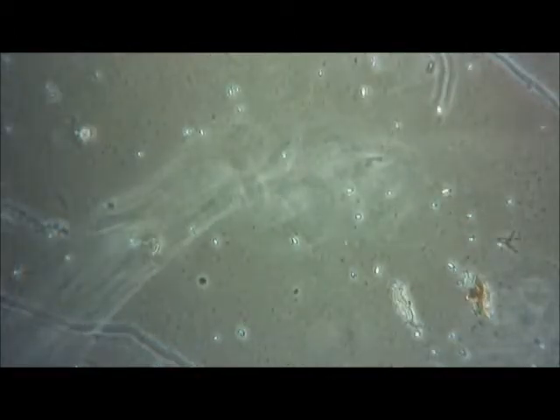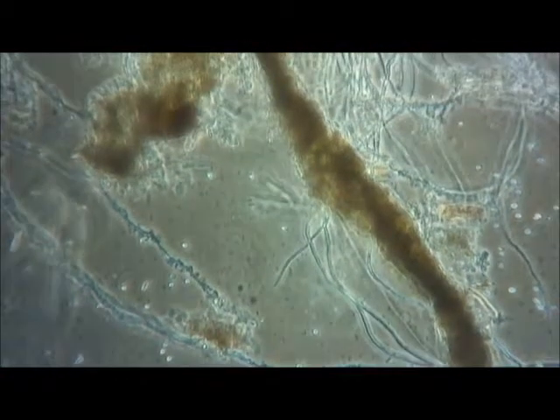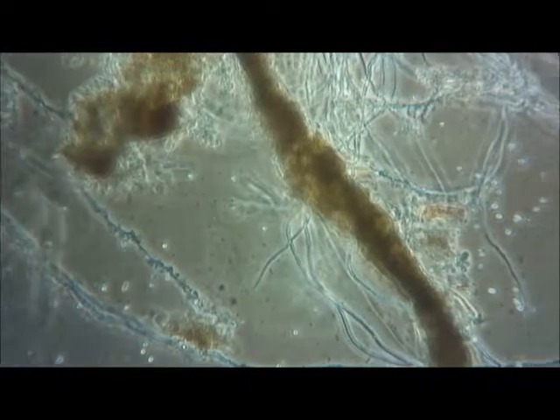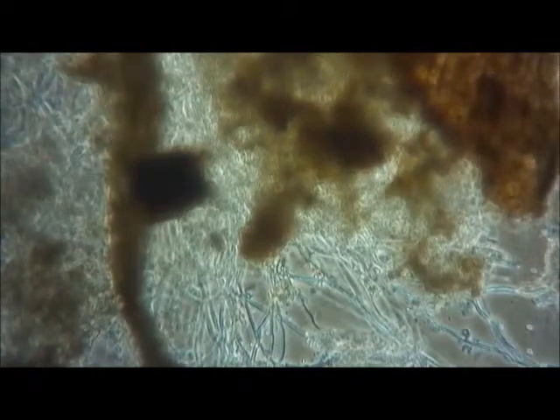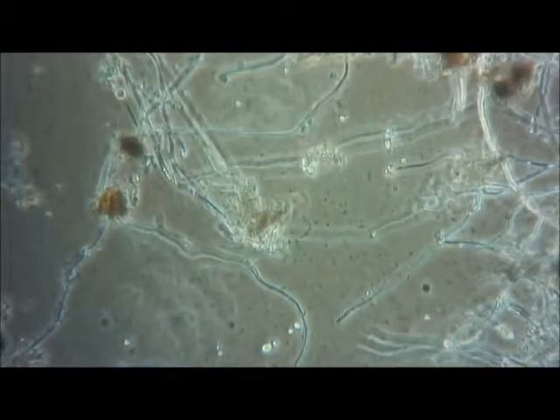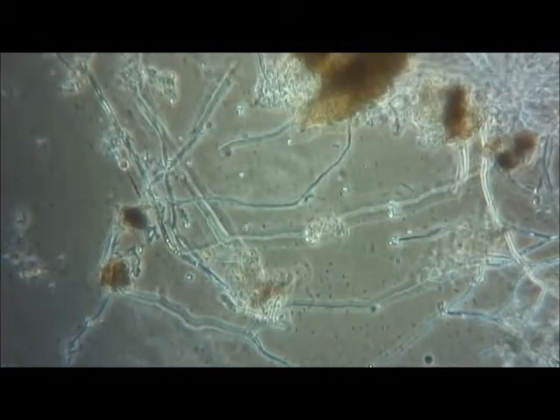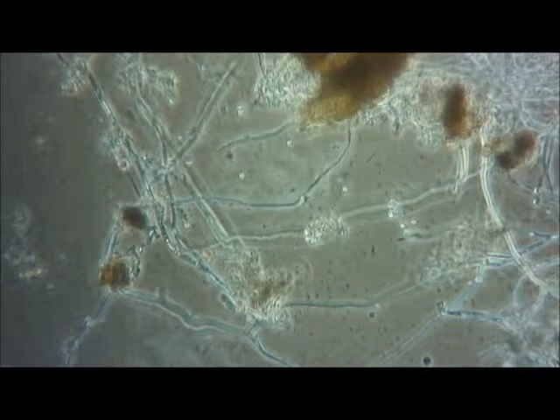Here are some microbial results using the 12-gallon bioreactor. This is what I call data. Here you can see that there are some flagellates swimming or moving around and lots of fungal hypha. This is at 42 hours using a vermicompost that we had sitting for quite some time and was perhaps a little bit dried out, and that's why it took a full 42 hours to get all of our microbial groups that we're looking for.